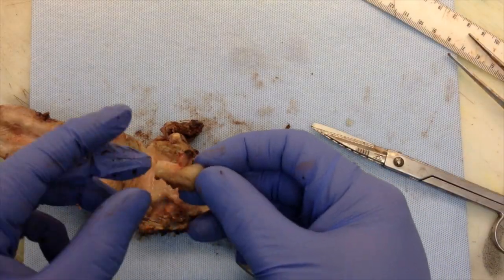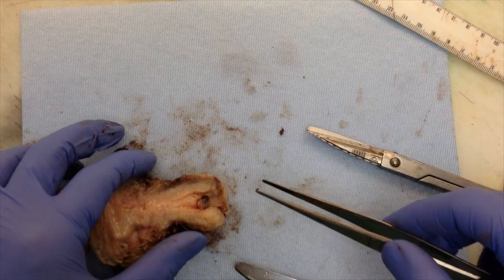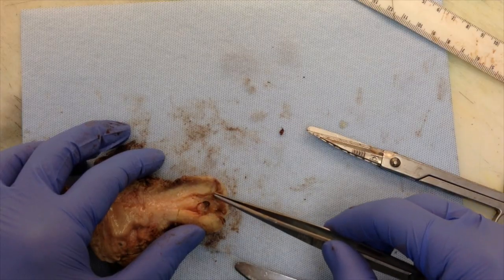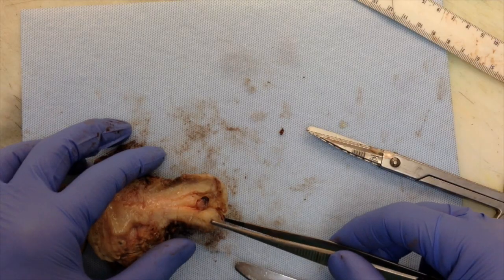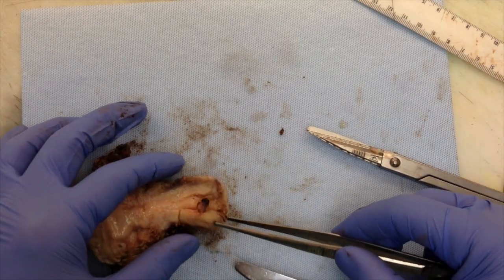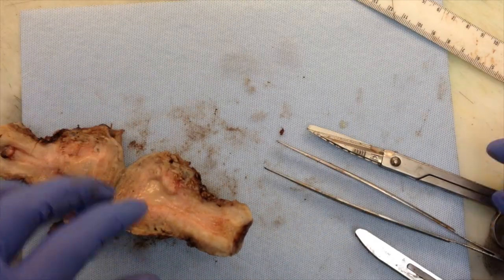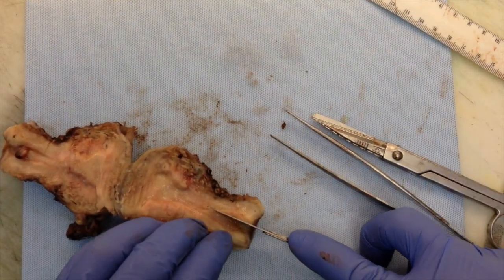So what we have here was here like this. So this is all squamous epithelium, and then it goes into this junction where it becomes columnar, and that's the squamo-columnar junction we want to demonstrate. But since there's this polyp here, I took it from the side, which still demonstrates the squamo-columnar junction and includes this polyp. So that's really nice. Normally, if there's nothing specific to demonstrate, we just take it straight from the middle.